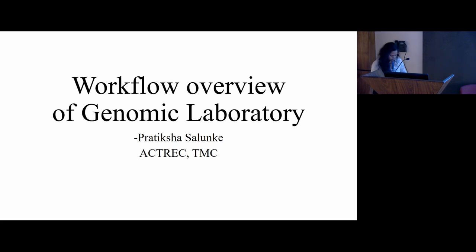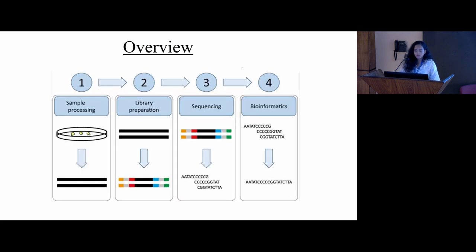Good afternoon, everyone. In this presentation, I'm just going to give you an overview of all the things that go on in a genomic laboratory or a molecular laboratory. The overview will consist of 4 sections: sample processing, library preparation, sequencing, and bioinformatics.